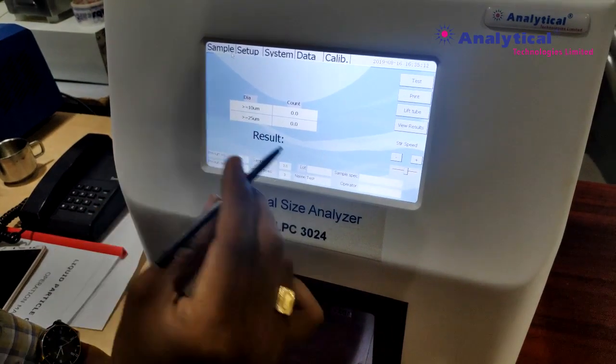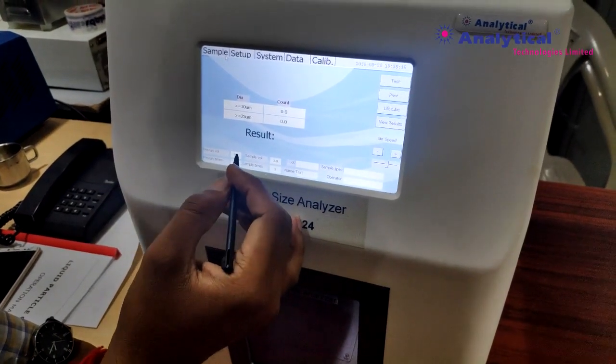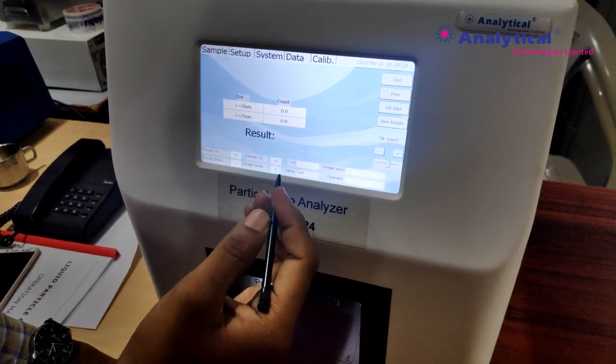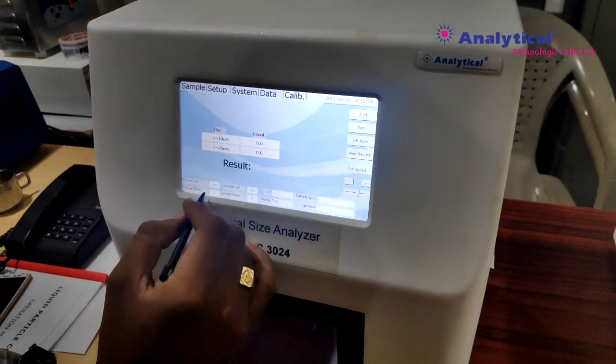The first one is the sample input. We can change the ratio or input data as per our requirement using this control.